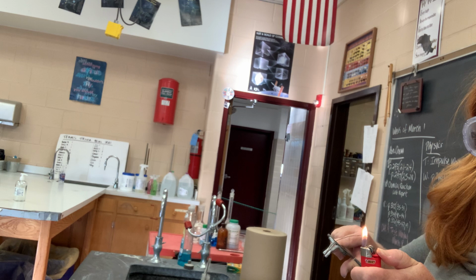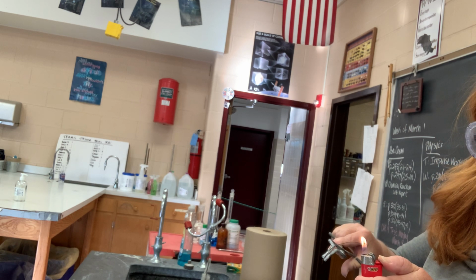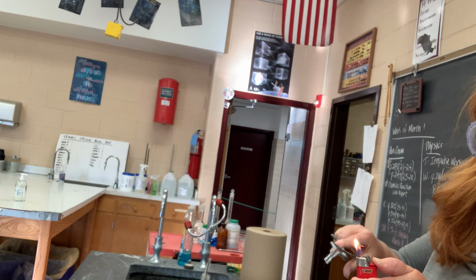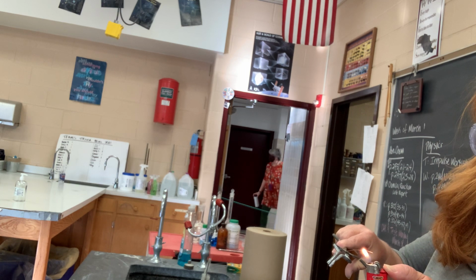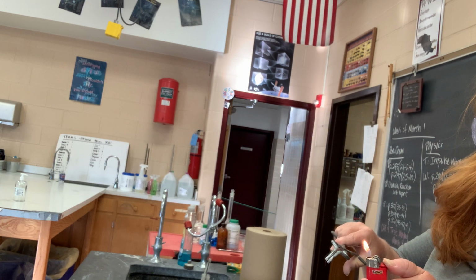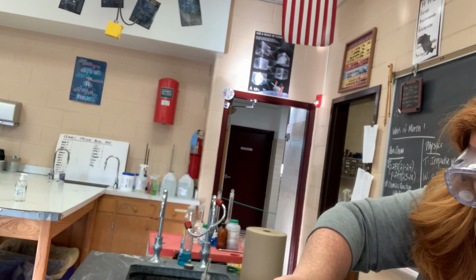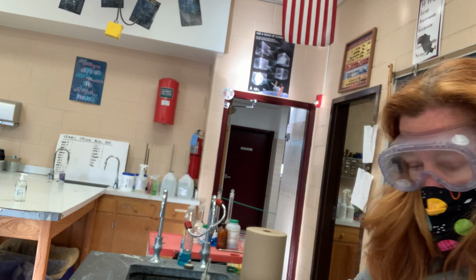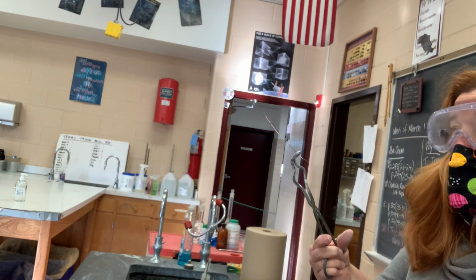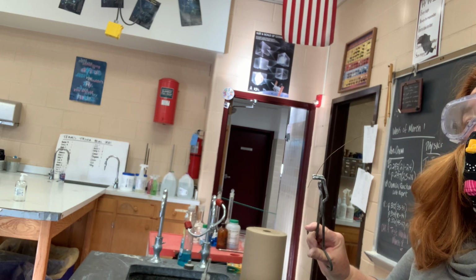It's never going to catch on fire like the other stuff, it's not going to react that great. But it's turning black. And it's stinky. I don't know why it's so smelly. It could just be the insulation burning off. But it's definitely turning black. So something different is happening. And I can get the little pieces of the black part to fall into the evaporating dish. That's getting really hot. Afterward, it completely changed color and some of the stuff is starting to flake off.